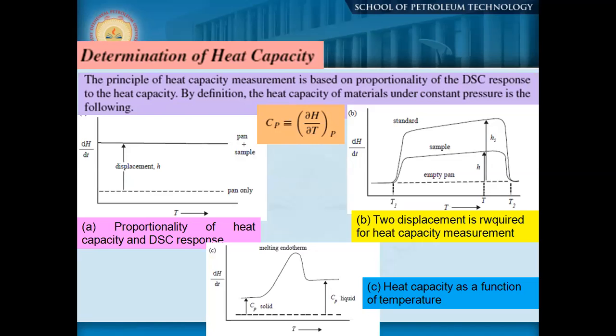First, choose the proper system, then see how the system operates, and depending on it, select your samples and sample holder. If these are not proper, you may not be quantitative, and you may not be able to characterize your material properly.